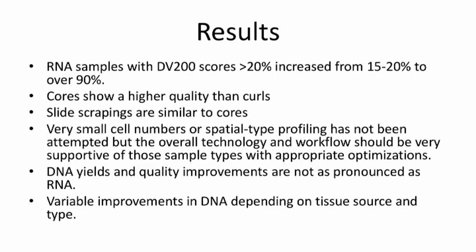As I mentioned, DNA yields and quality improvement are not as pronounced as RNA. What we've seen is variable improvements in DNA, really depending on tissue source and type. And I think it just depends on how highly damaged the material was coming in.